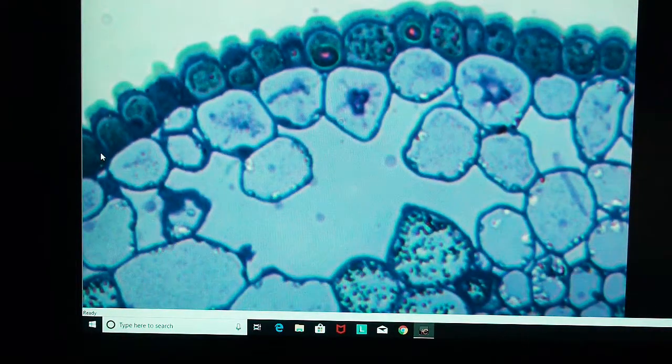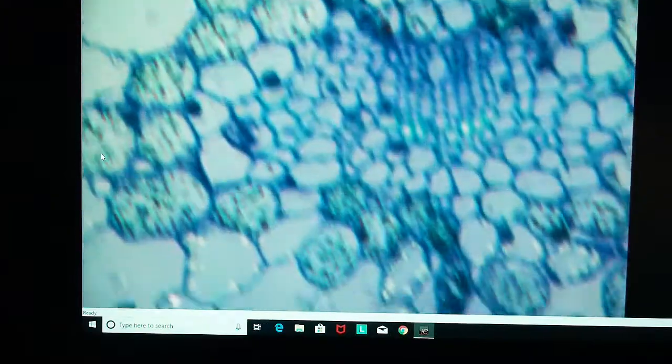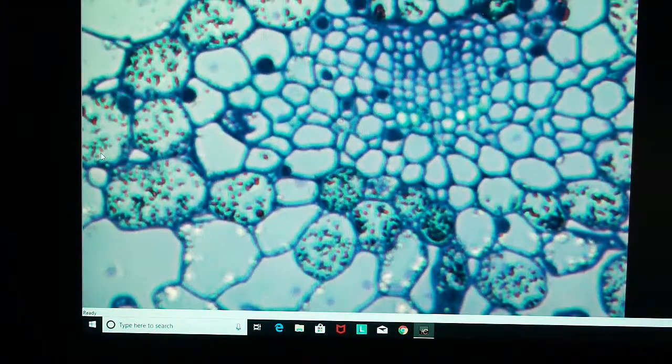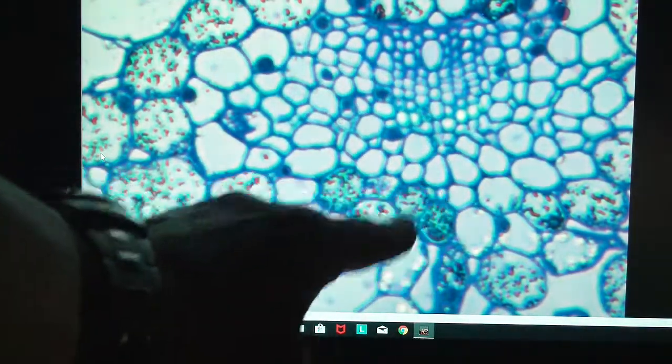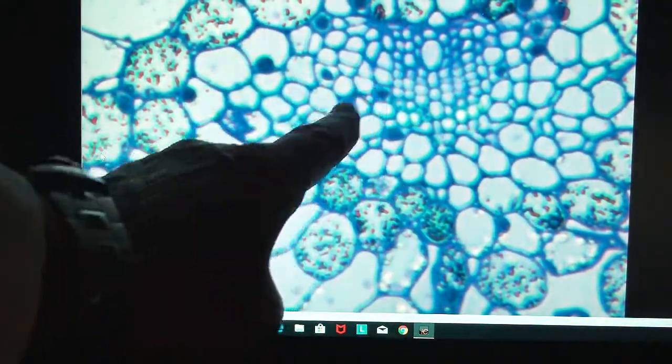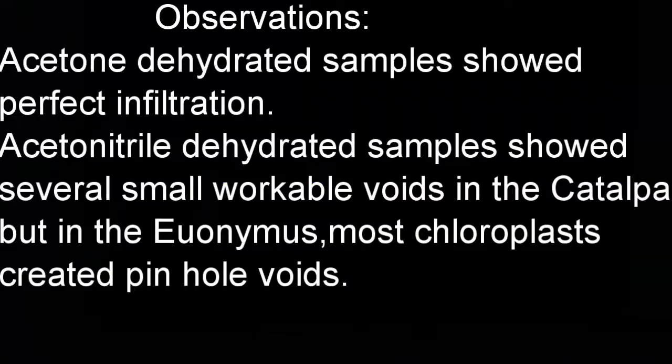The upper epithelium looks good. But again, you can see the areas where the chloroplasts are, do appear to be infiltrated, not well, not very well infiltrated. The vascular bundle looks good. So acetone dehydrated samples showed perfect infiltration and for plant material, especially the large ones, is very good. The acetonitrile, it did pretty well for the catalpa, but the euonymus, most of the chloroplasts created pinholes and it's not very good. Thank you.